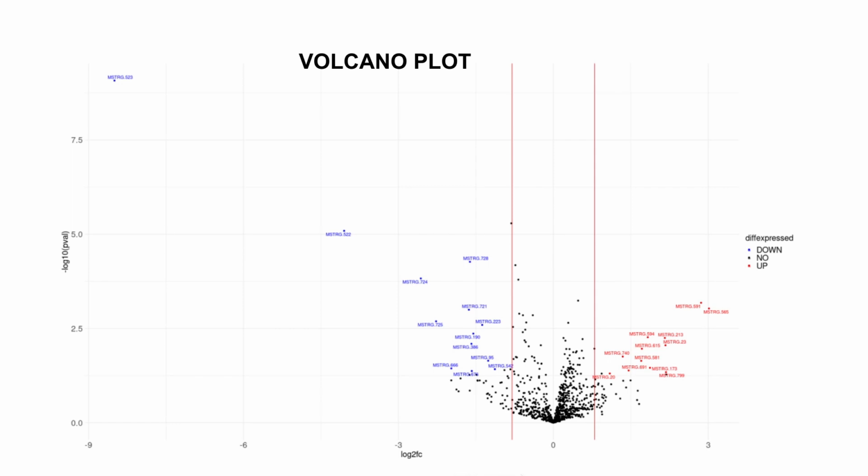And that means you'll be able to go further and identify down-regulated, up-regulated, or those genes that are not differentially expressed. So this is how volcano plots can be used to visualize the data. And you can represent each of these groups using a color code, as has been shown here. With the volcano plots, you see that the left side has the down-regulated genes, and on the right side we have the up-regulated genes. The middle has those genes that are not differentially expressed. You can go further to give additional labels to genes that are of interest to you.